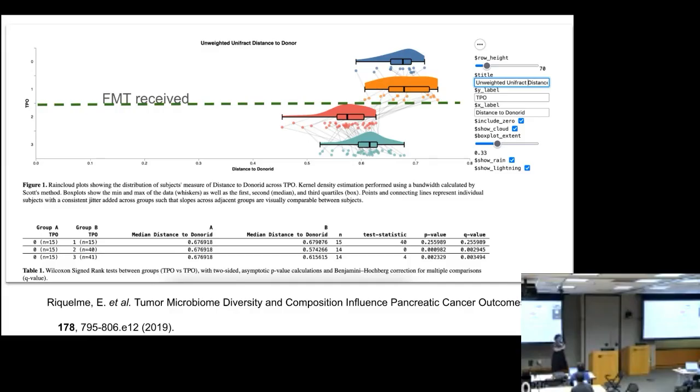So that would be beta diversity, looking at the differences between two gut microbiomes, right? And here we're looking at their distance to donor. After that antibiotic time point, we are more different from our donor than our baseline is. Does that make sense to people? It's just because we end up wiping out the microbes that probably were in common between the donor and the recipient. And so we end up with a less common microbiome, or less in common in those two microbiomes.